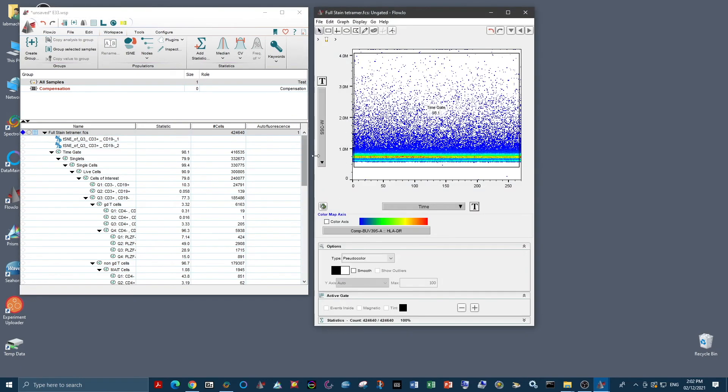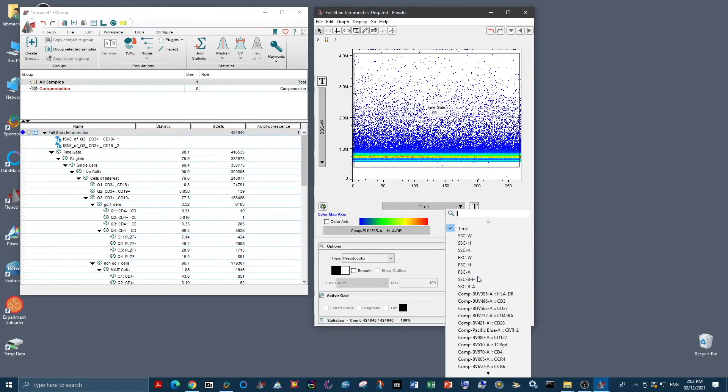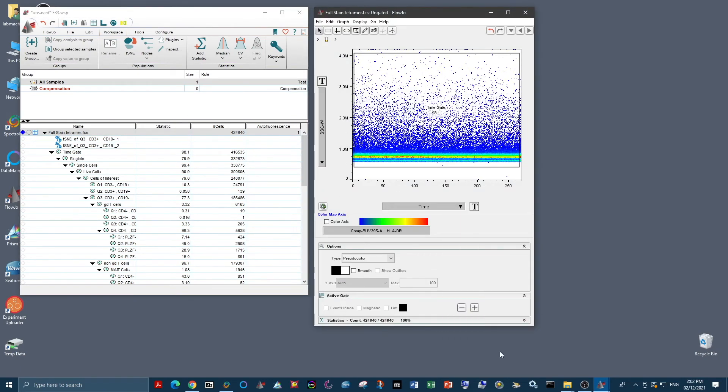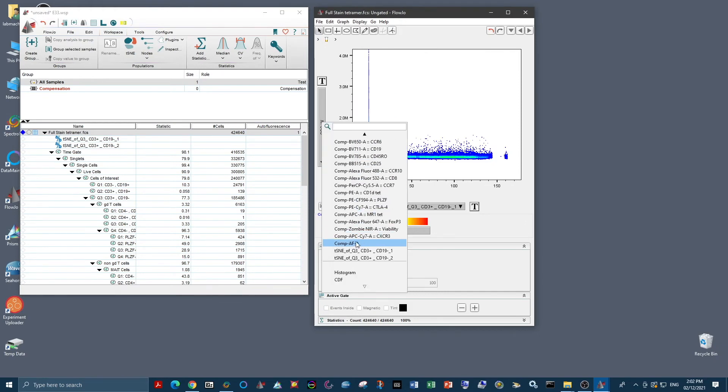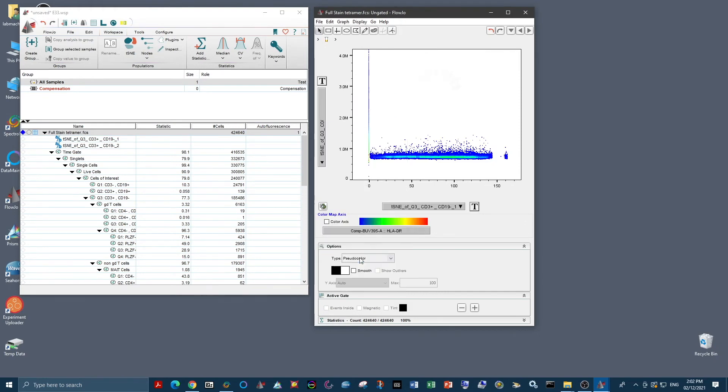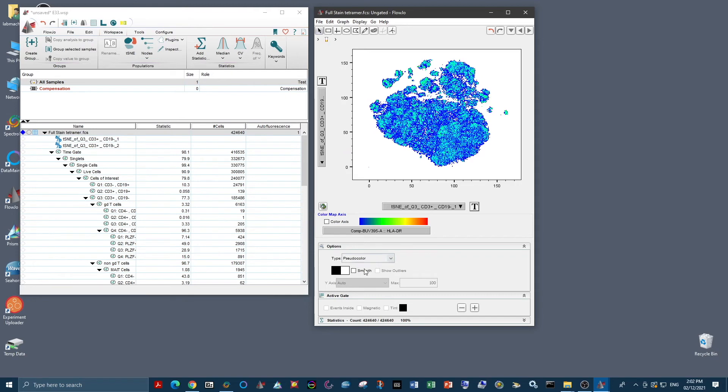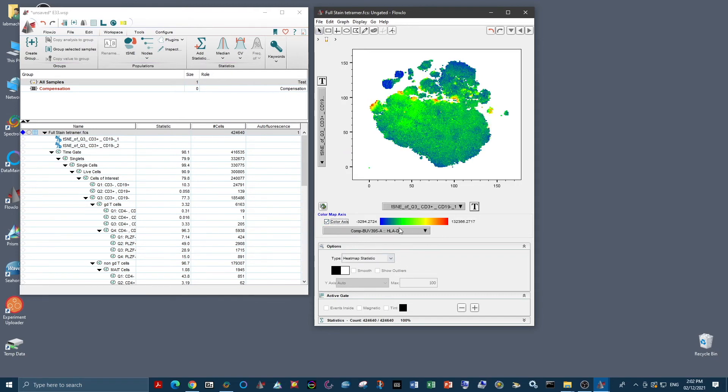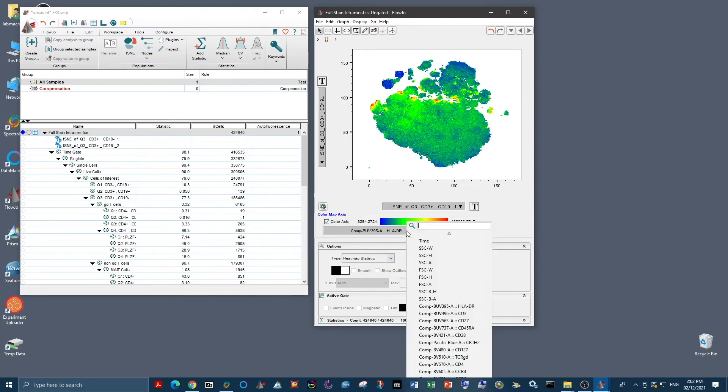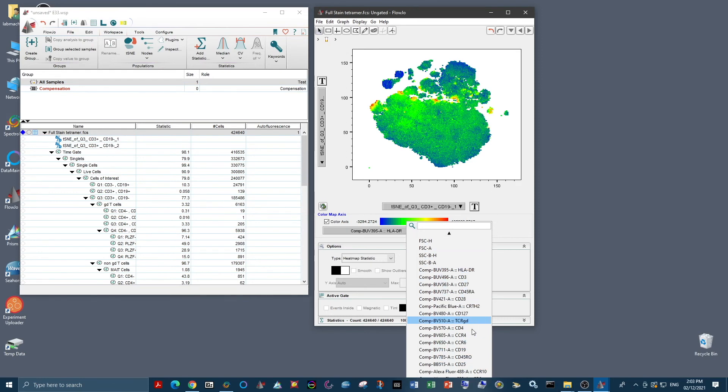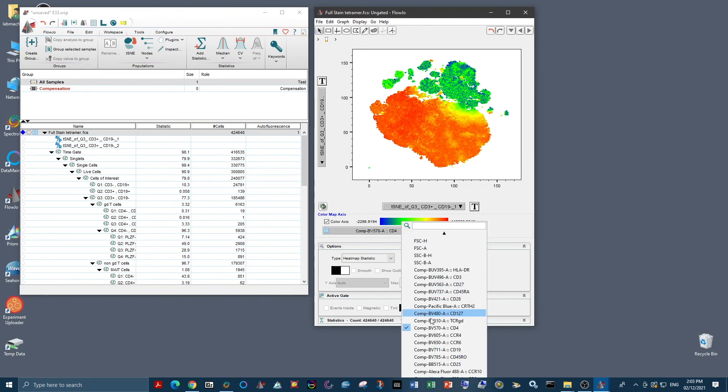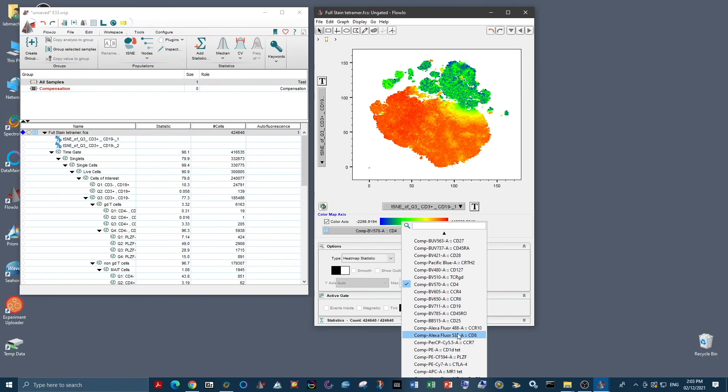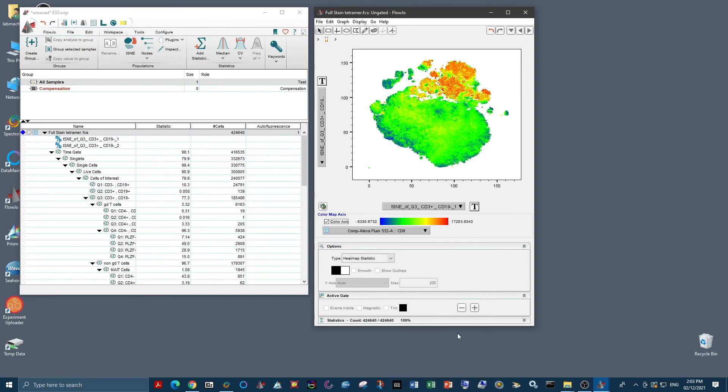So once your tSNE is run, you just open your sample and plot the two tSNE parameters on X versus Y. And then we can color our axis based on the different fluorophores in our panel and make sure all of our markers co-localize in places that we would expect. So if we were to color based on CD4, we can see that this large island here is very positive for CD4.